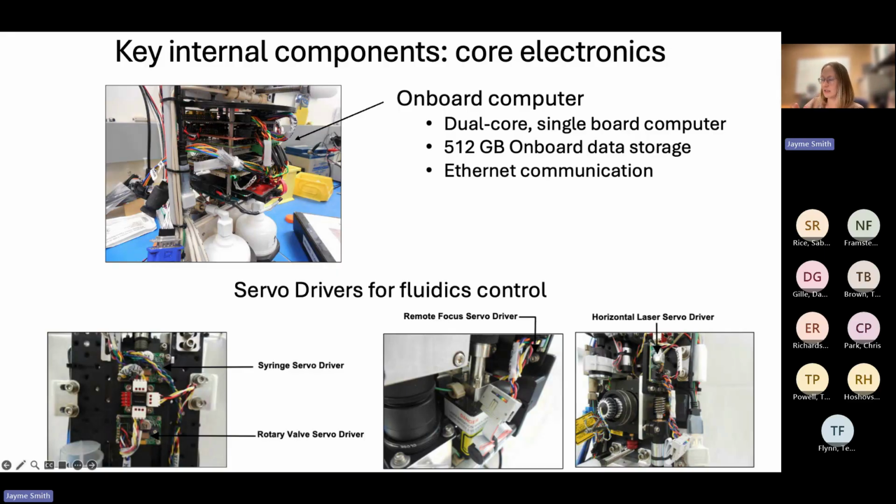So that's the instrument itself. I hope you're taking away from looking at this that there are a lot of pieces to manage. They're very powerful, but very intensive, and there's a 3-day training course to learn how to run all of these different things and really fine tune it.